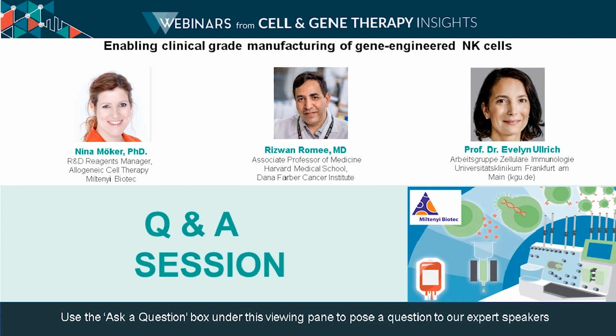But it's very manual, and that brings a lot of delay and labor intensity, because every manual step you add basically means delay. So in terms of how to make life easier for everyone, if you can build in analytic tools, where you have the capacity in the closed system to take a sample internally and stain for key elements, including, say, transduction efficiency, viability, and things like that, and generate a number that meets the threshold, that will make life easy for everybody. So that's in terms of QC analytical tools.